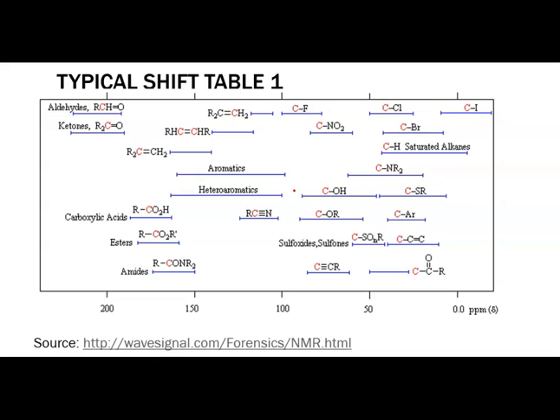But what's happening is that we imagine that there's a magnetic field that is applied to a substance. And so what we've talked about is, one of the ways to remember is that what if we had a large magnet off to the right of this spectrum here? It's an imaginary magnet, it's not a real magnet, but we imagine that there's this large magnet here. Carbons here near 0 represent those carbons that have strong magnetic fields. We could imagine that they are strong, and so they can withstand being near a big, strong external field.